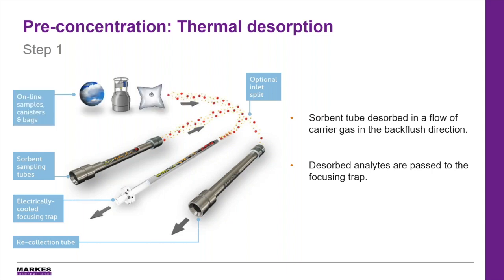With thermal desorption, though, as we just discussed, tubes aren't the only way of introducing the sample. So if we've got online samples, canisters, or bags, we introduce that whole air directly onto that multi-bed focusing trap ready for analysis.